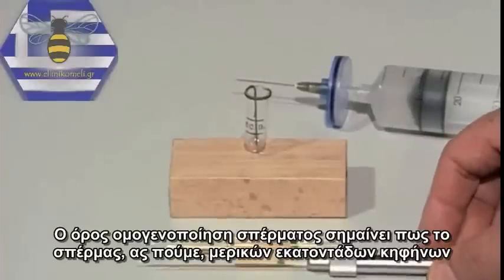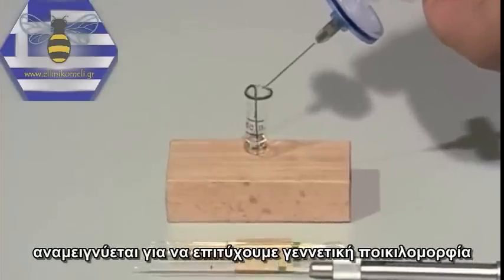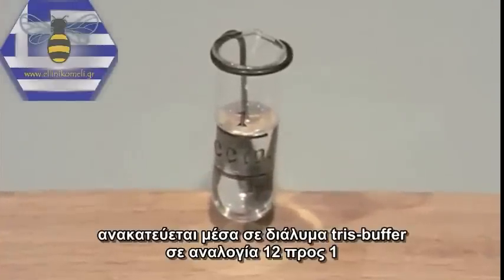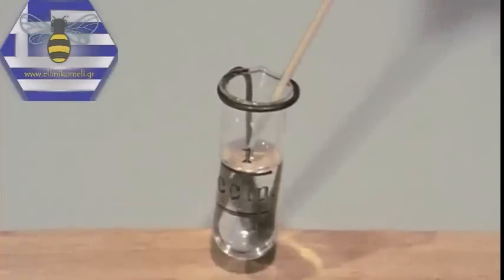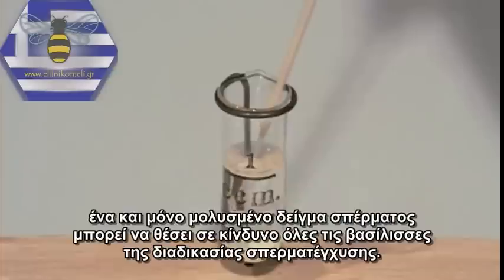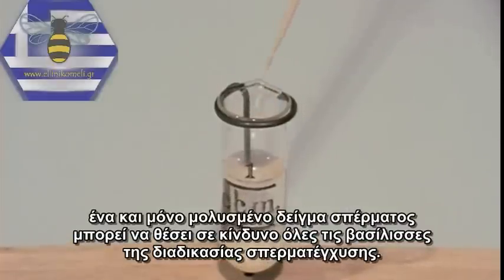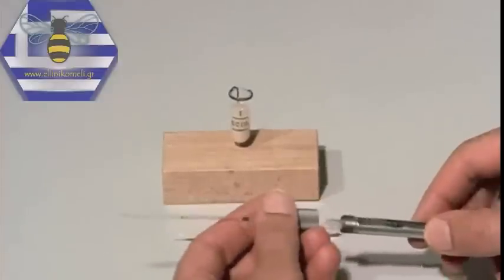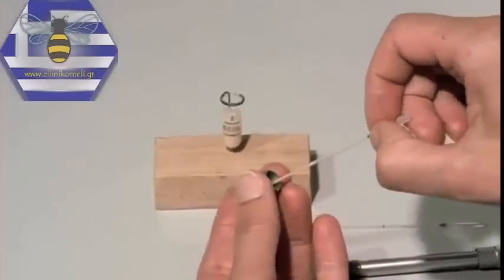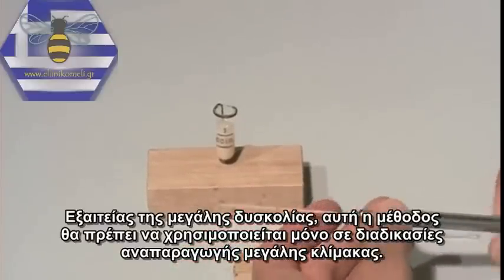The term sperm homogenisation implies that the semen of several hundred drones is blended to increase genetic diversity. To do this, the sperm content of several capillaries is diluted with Tris buffer solution in a proportion of 12 to 1. Every operation must be carried out under ultra-clean conditions, because a single contaminated portion would adulterate the entire batch of semen and endanger all the queens of an insemination series. Because of the high effort involved, this technique should only be applied to large-scale breeding programmes.